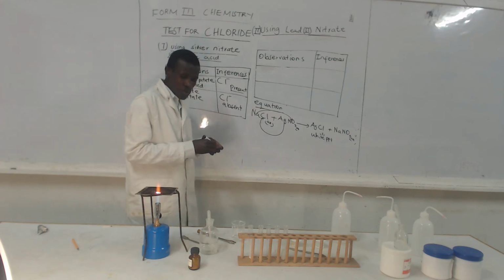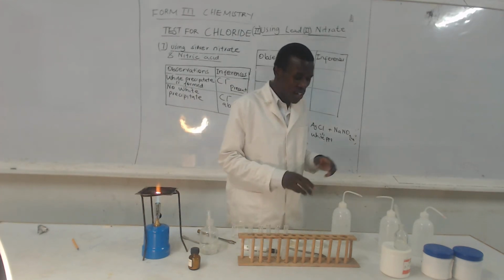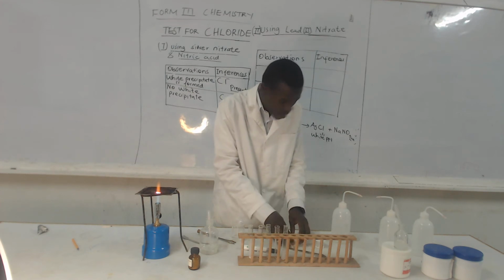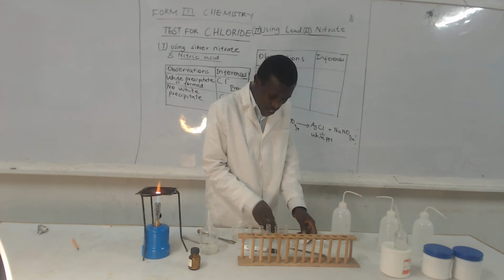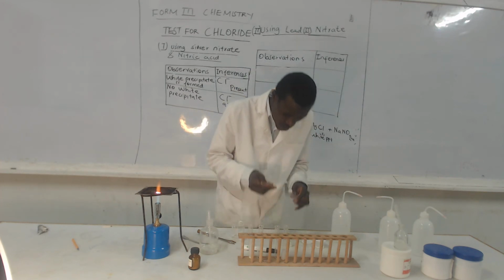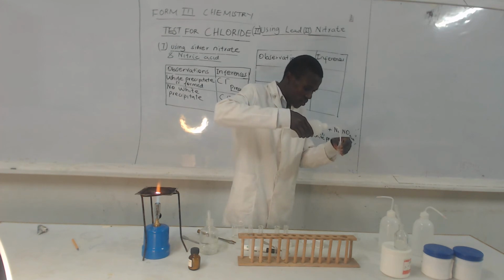What about procedure number 2? Procedure number 2, we are using lead nitrate. You again take a sample and then you form a solution.